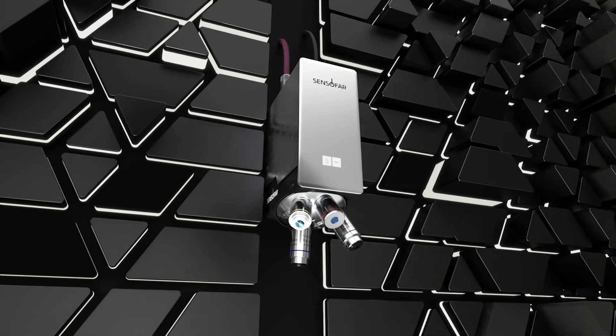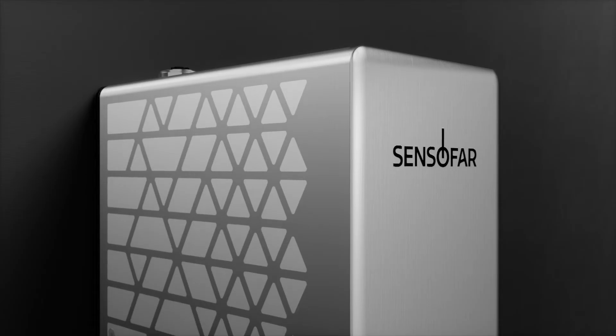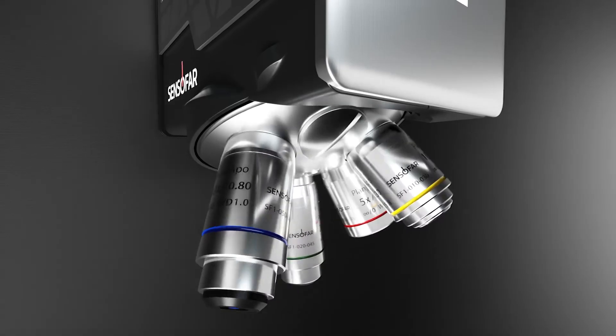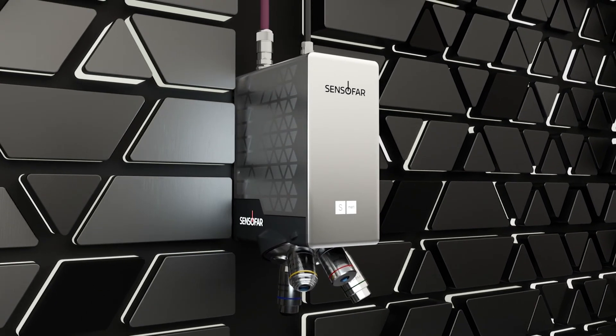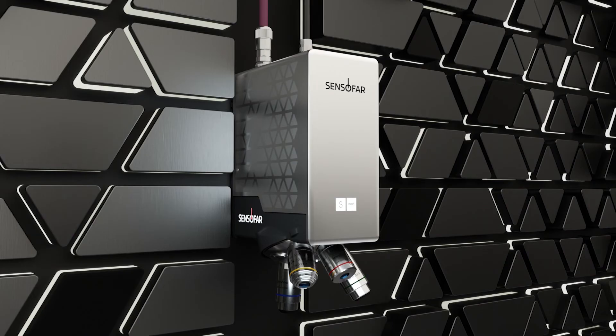This new aerial confocal sensor is aligned with the highest standards that the industry demands in integrability, usability and performance. S-Smart 2, where versatility meets autonomy.